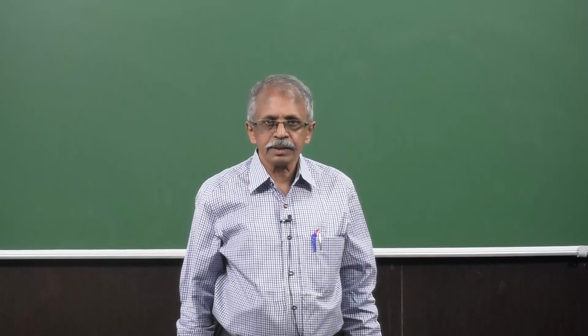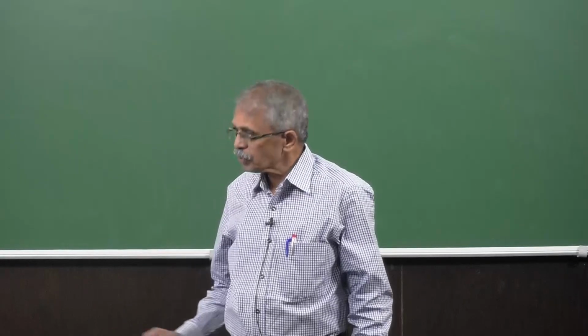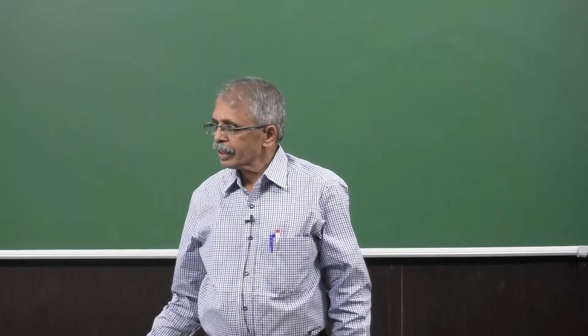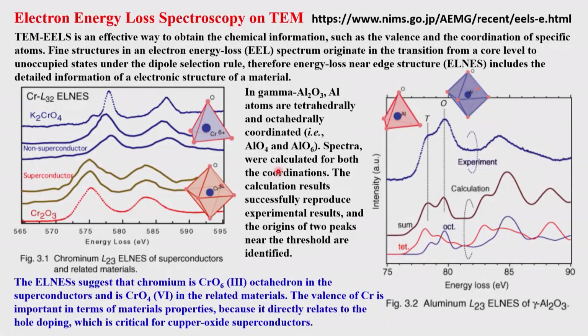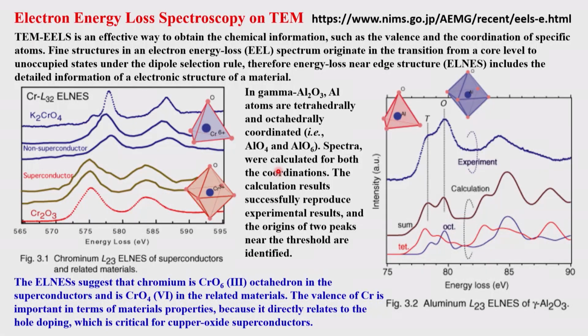And immediately before closing the previous lecture, we looked at a case where we can identify even the coordination type, nature, and coordination geometry, which would reflect on the electron energy loss spectroscopy, where in the near edge of that particular peak you can get information on the chemical as well as the bonding type and the coordination nature, all of these.